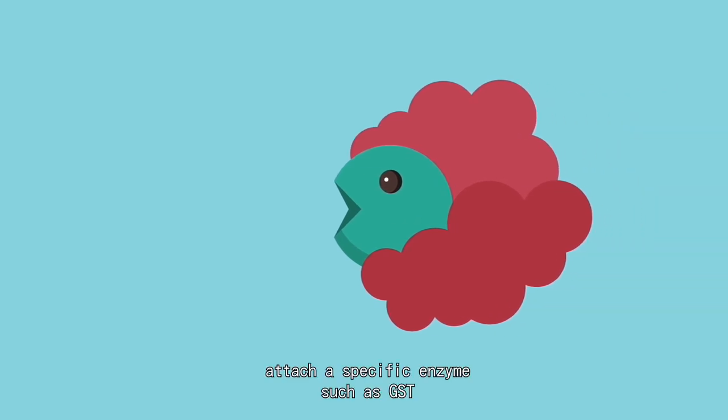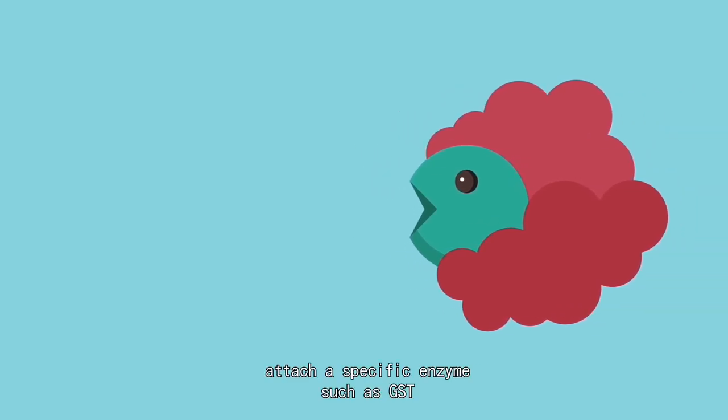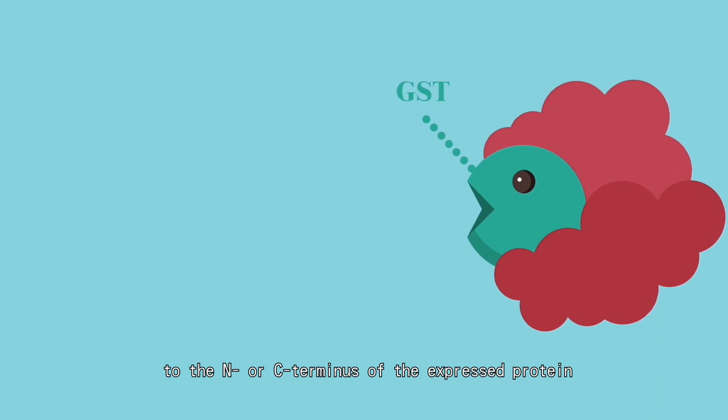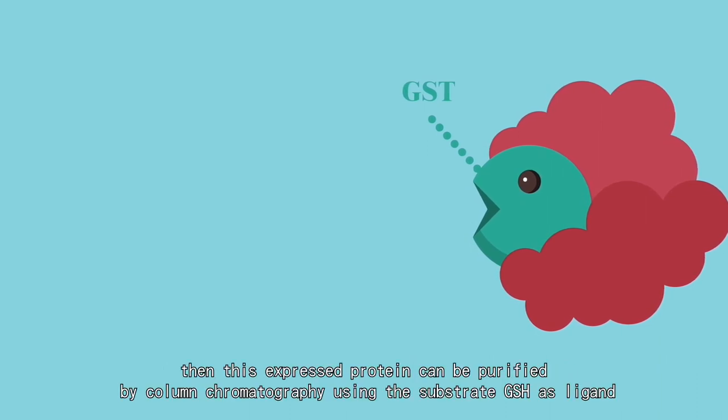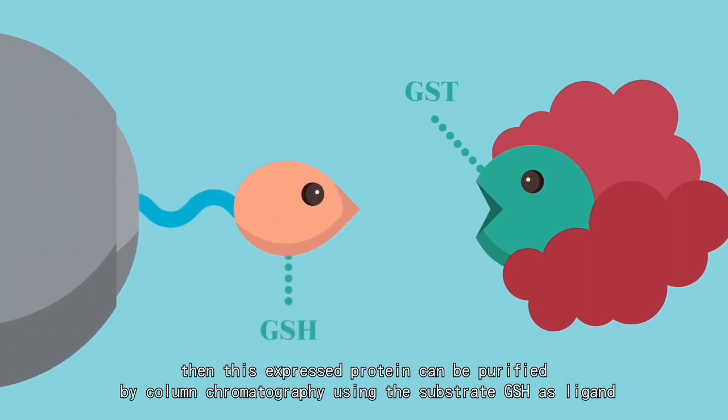Similarly, attach a specific enzyme such as GST to the N or C terminus of the expressed protein. Then this expressed protein can be purified by column chromatography using the substrate GSH as ligand.